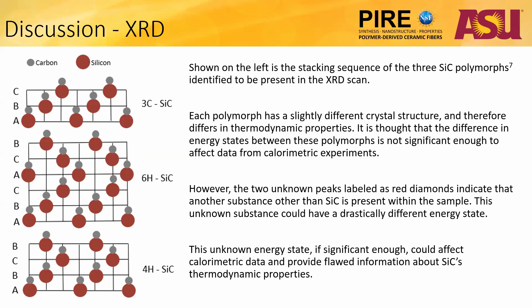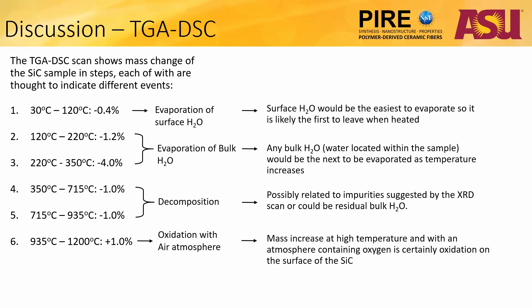Also previously mentioned in the XRD scan are the two unidentified peaks labeled as red diamonds. Because these peaks did not match any SiC reference scans, it suggests that compounds other than SiC could be present within the sample. With unknown other compounds present, their different energy state could be enough to alter the heat of formation, thus giving an inaccurate value and flawed understanding of SiC's thermodynamic properties.